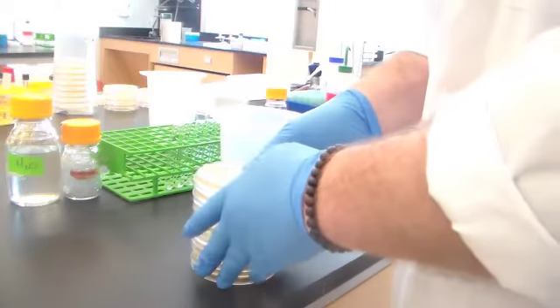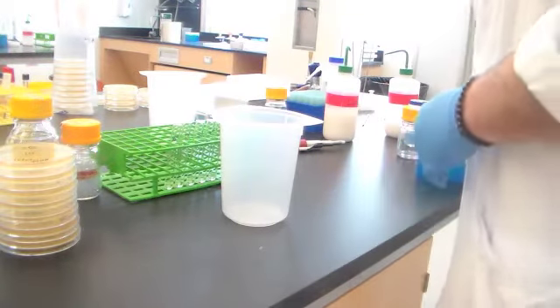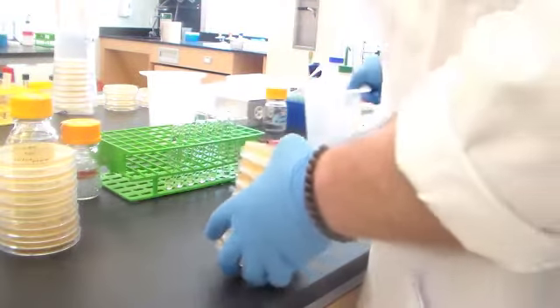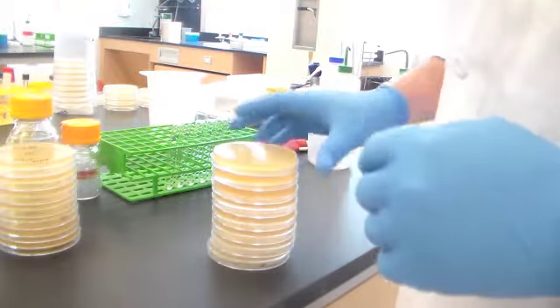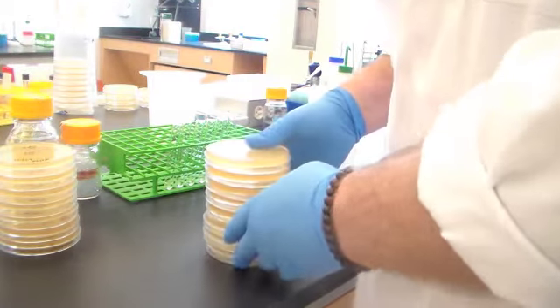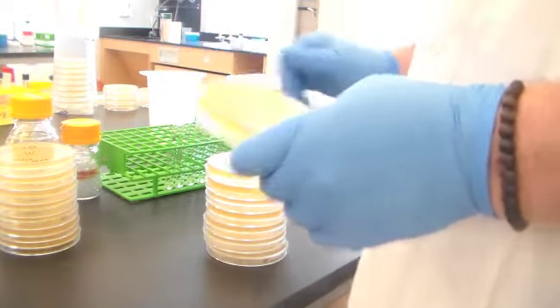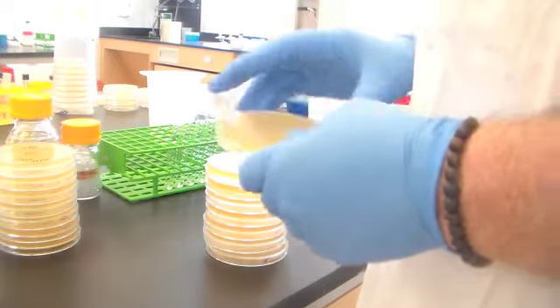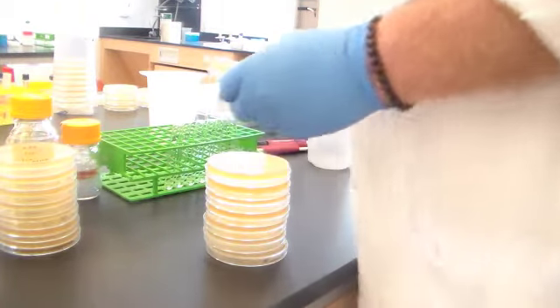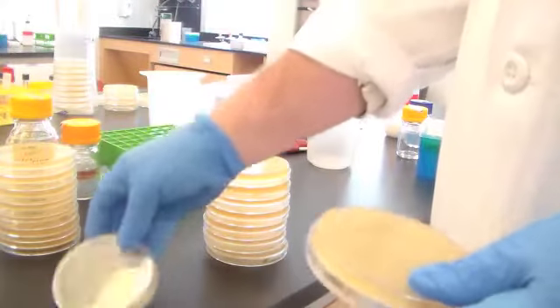Okay, so that is a completed dilution series. Those will go in the incubator to go overnight. Now, like every good cooking show, I went ahead and yesterday I titered out a culture and I diluted it out to 10 to the minus 8. So these are E. coli plates, same type of plates, tryptic soy agar plate. Well, let me first show you what the uninoculated plate looks like. You know what those look like.